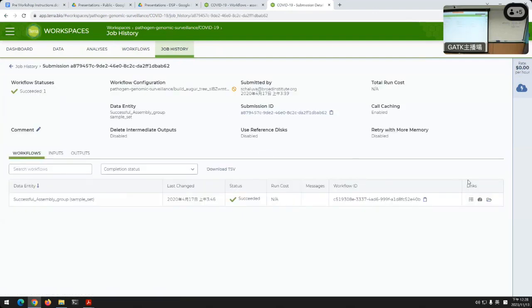If I want, I can click into these, and I can learn in a lot more detail what went on with them. Over here, there's something called the job manager that gives you a very detailed view of how your workflow actually went. It gives you things like timing diagrams to tell you how long each step took.